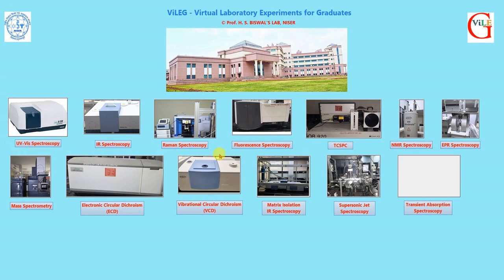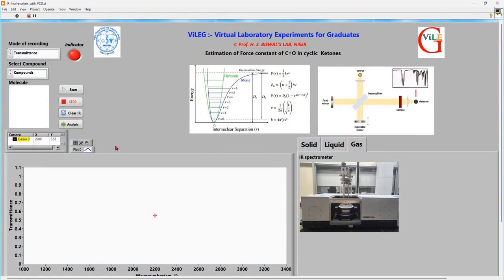Here we will learn about various spectroscopic techniques. Previously, the UV visible spectroscopy and fluorescence spectroscopy were demonstrated. Today we are going to learn about IR spectroscopy.